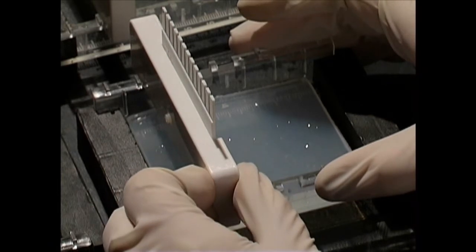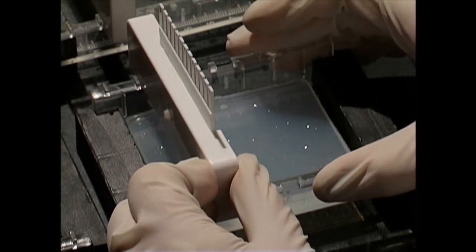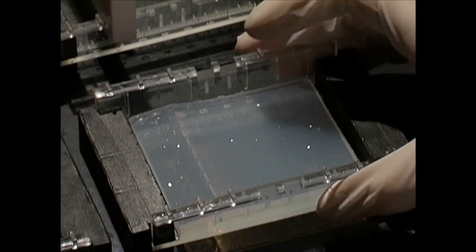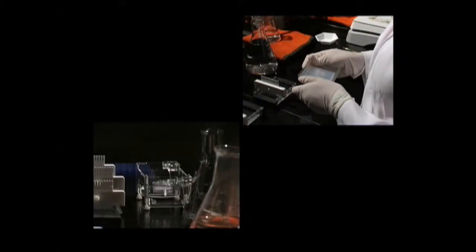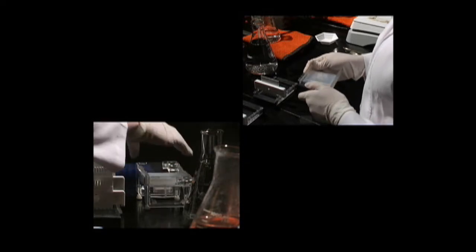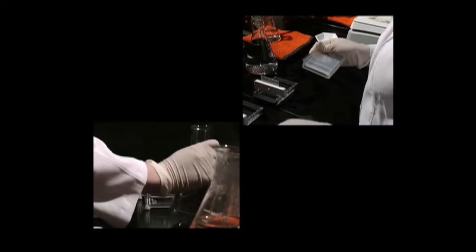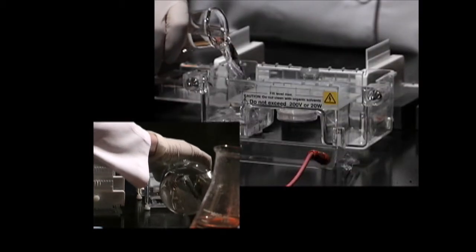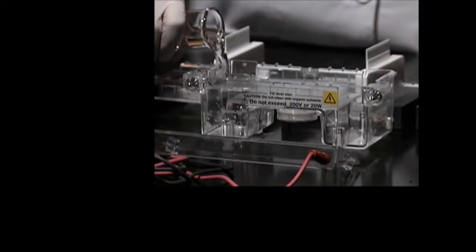It will be firm and cool to the touch. Once the gel is solidified, carefully and slowly remove the rubber dams and comb. Place the gel bed into the electrophoresis chamber, centered and level on the platform. Fill the chamber with diluted buffer. This type of gel is often called a submarine gel because it's submerged under a buffer.